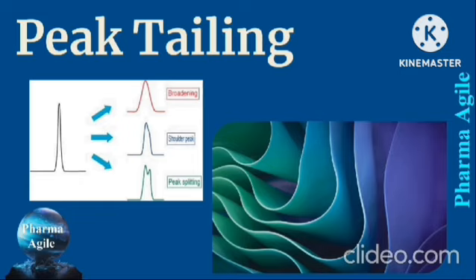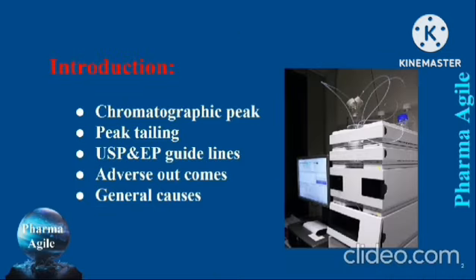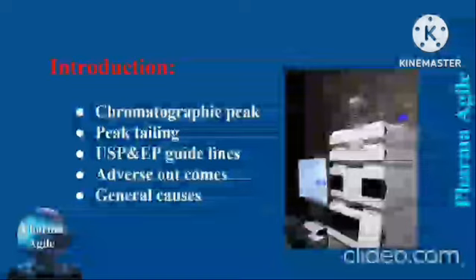In this video, I will explain points like these. Chromatographic peak: what is a chromatographic peak? What is peak tailing? What are the USP and EP guidelines for peak tailing? What are the adverse outcomes of peak tailing? What are the general causes of peak tailing in the pharmaceutical industry? And how to solve these causes for a better chromatographic peak in the pharmaceutical industry?